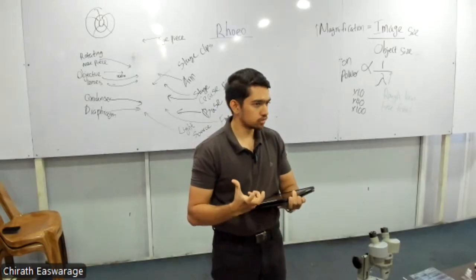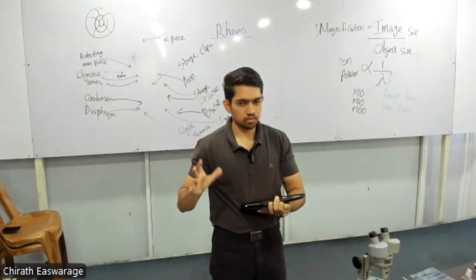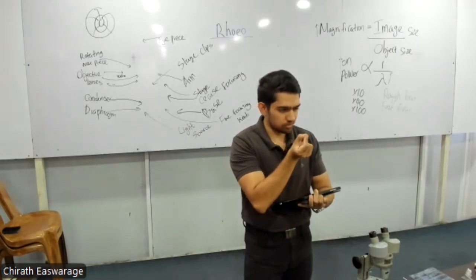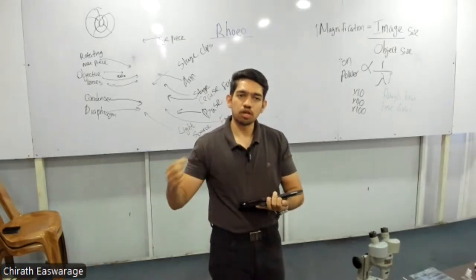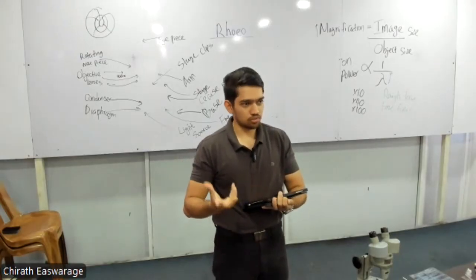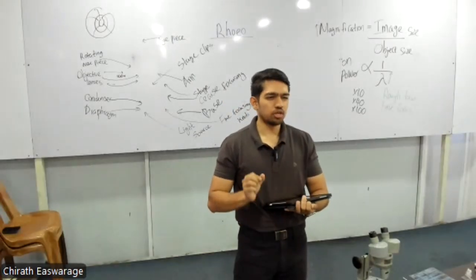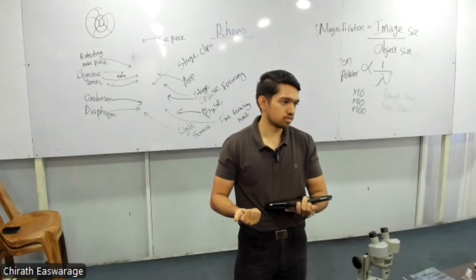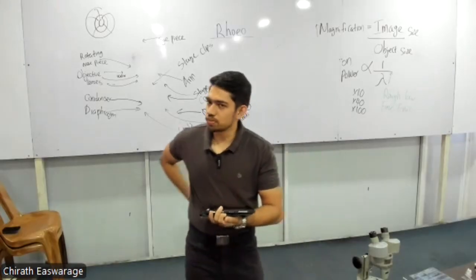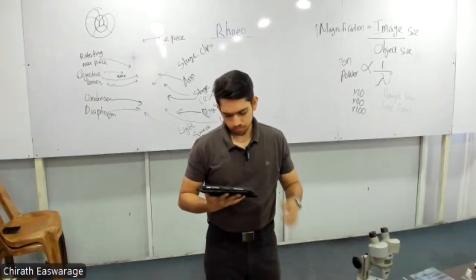We sometimes have to use gold. Other than the fact that the microscope is very expensive, the staining is very expensive as well. You need only a microscopic amount of gold, but more than the value of gold, the staining procedure is complex. So electron microscopy in general is a very expensive procedure. We usually limit it to observing viruses, to study the structure of viruses at this stage, because light microscopy is sufficient to study bacteria.